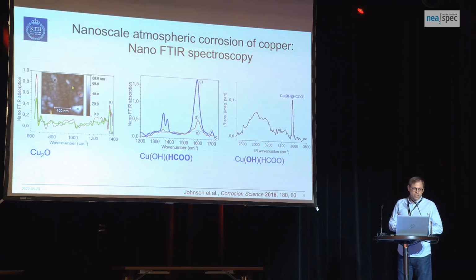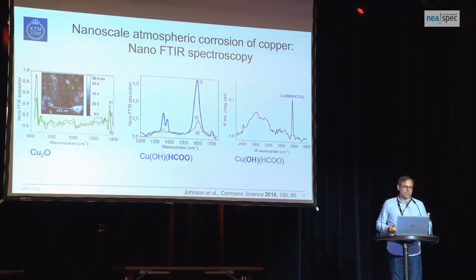And with this last laser then, we can of course also probe the OH bond of this one. And you also see the broad band here, which is like a mixture of water in the film and also hydroxyl ions.